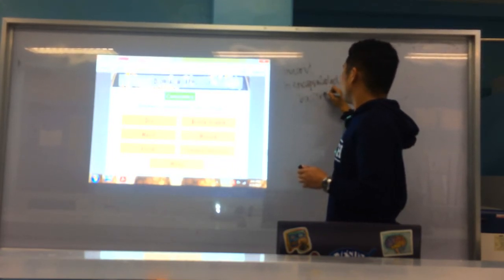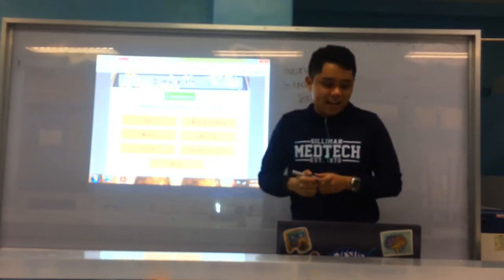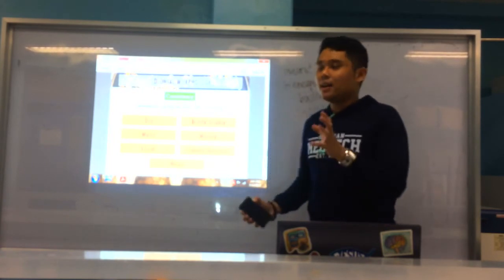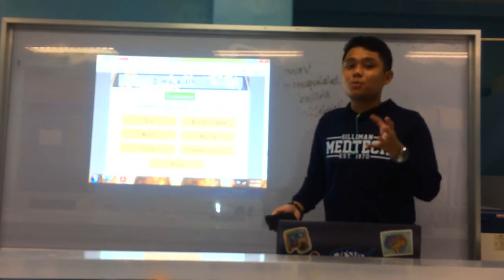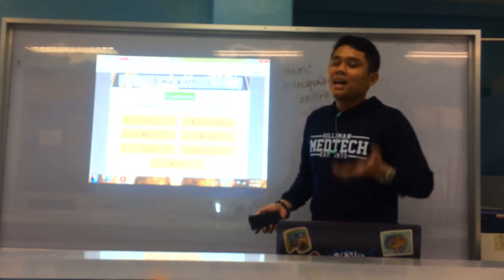A very, very good example is Klebsiella. Its colonies are very mucoid, so nice. Klebsiella pneumoniae, okay? Very mucoid because of the capsule. So if the colonies on your plate are mucoid, then it could be that the organism is encapsulated.